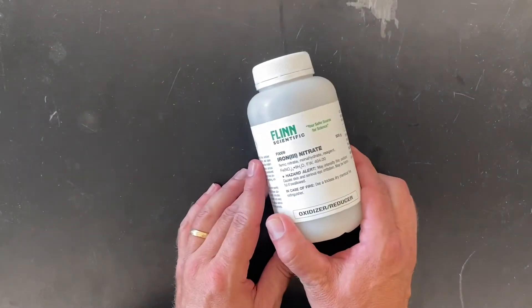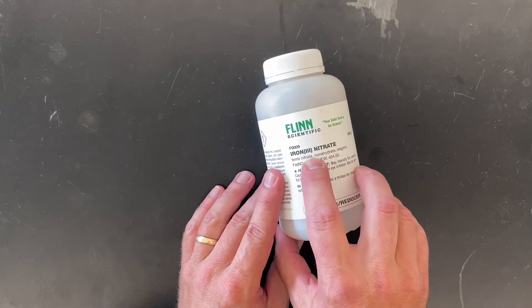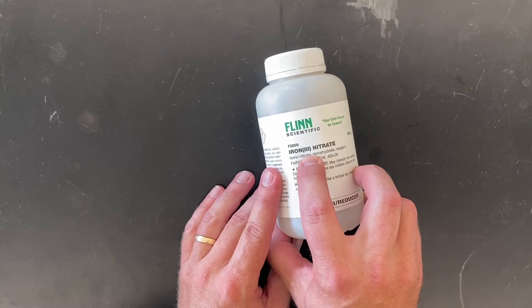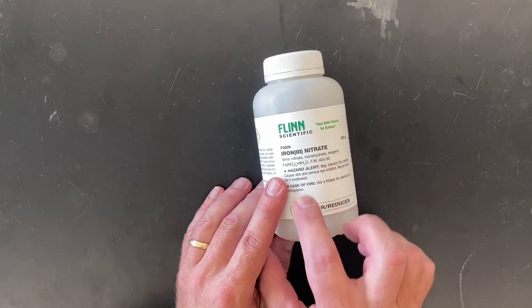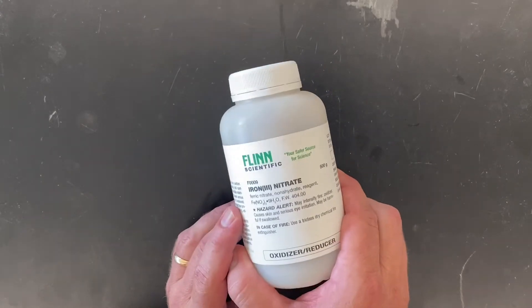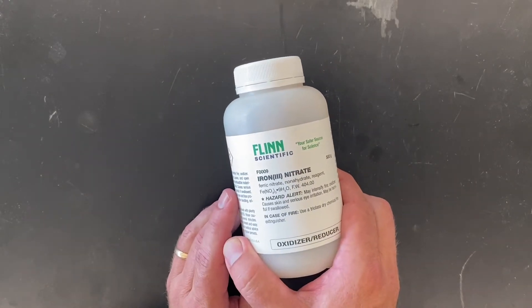We needed some iron(III) nitrate. You'll be learning what that Roman numeral 3 means and how to write formulas for things. This is a nonahydrate, which means nine water molecules are stuck in there per formula unit.